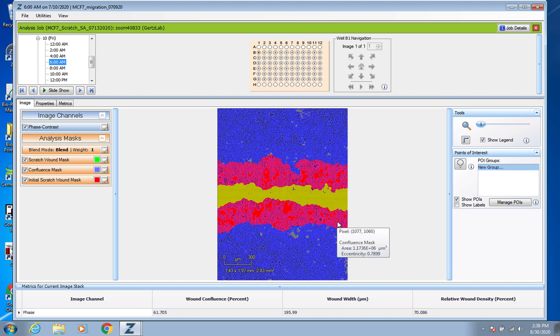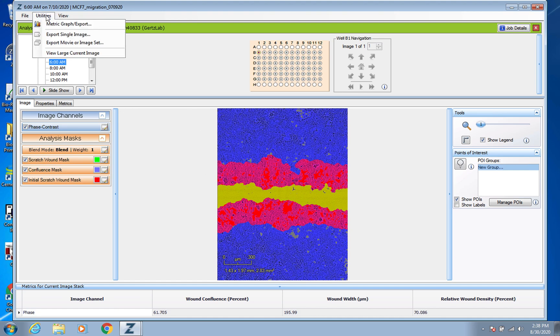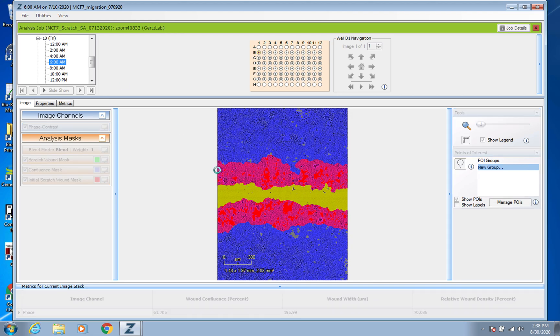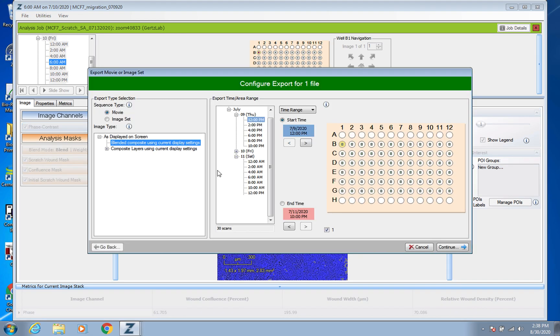So right now about 61% of the original scratch space has been refilled with cells, cells have migrated into that much. This is where it can get kind of cool as far as getting images. You can actually export a movie.